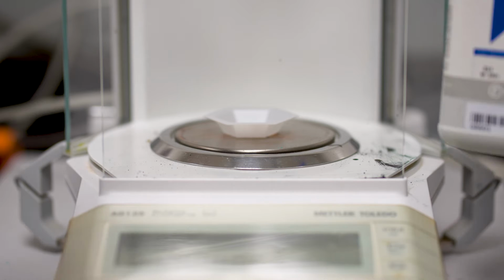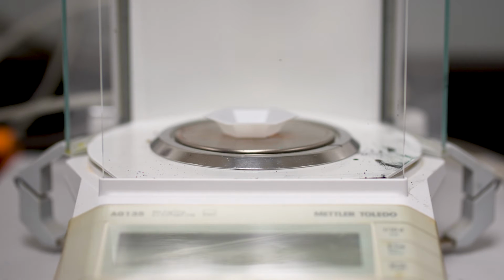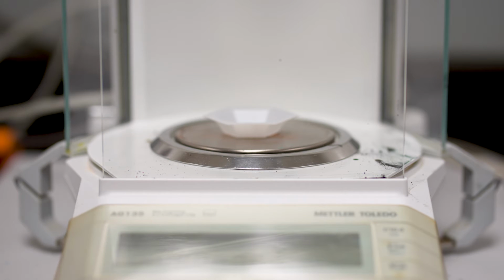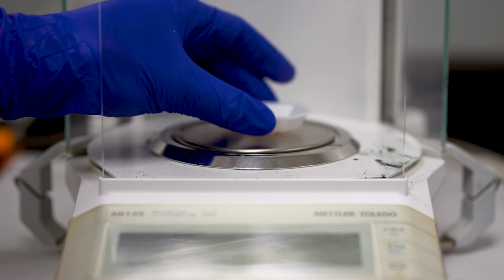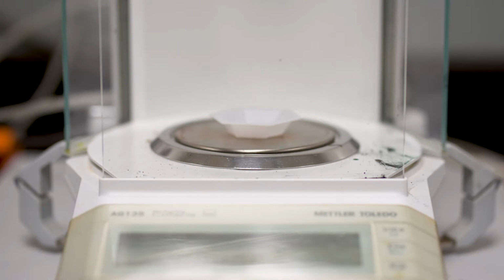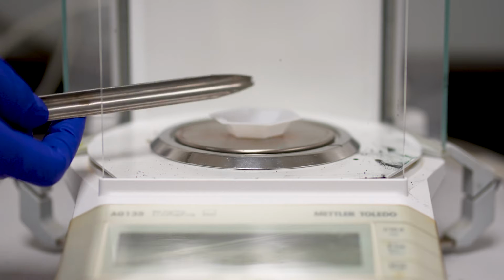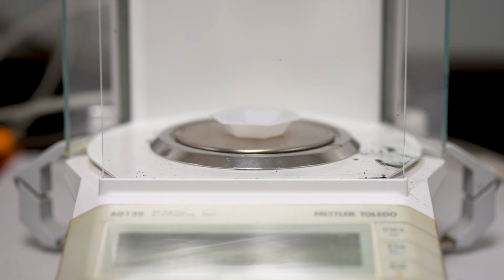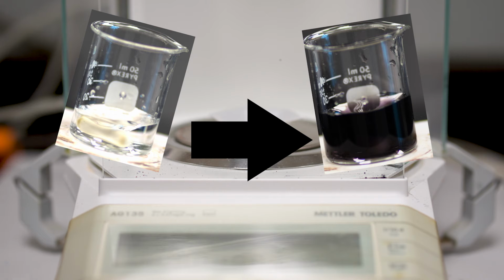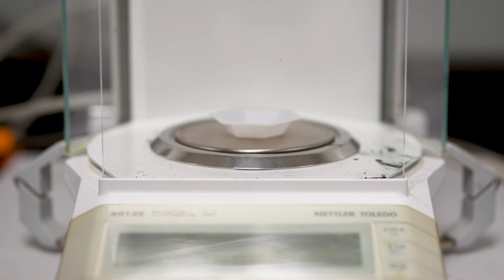A clock reaction in chemistry refers to a chemical reaction in which there is an observable change over a predicted duration of time. It is usually used to help determine the reaction's kinetics. The iodine clock reaction is a kinetic experiment that explores reaction rates, and a color change to a dark bluish black is observed when I2 reacts with starch to form a complex.